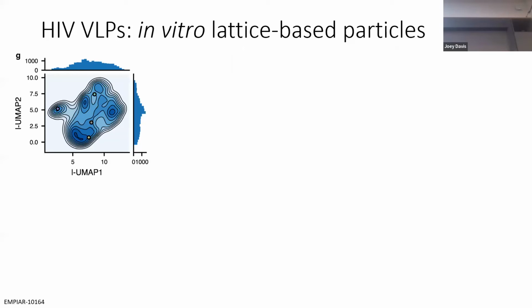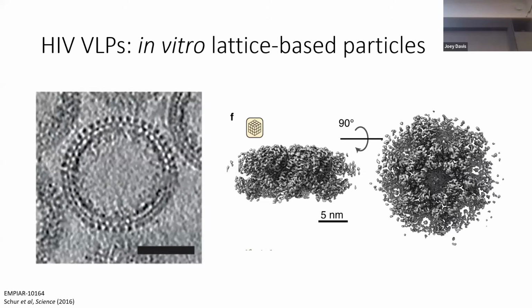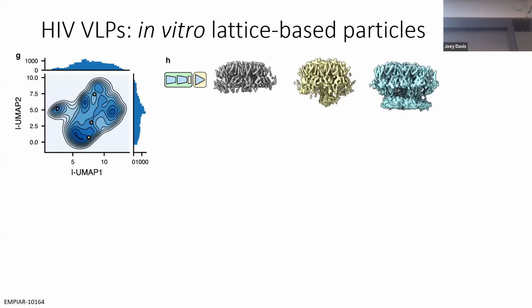I should say that this basically recapitulates the sort of structure that everyone determines when they look at this by tomography. But if you look more closely with TomoDRGN, you now actually start to see that there's heterogeneity. There's a whole other domain that's a little bit below the primary domain that everyone sees. That's encoded in the polypeptide. Everyone knew it was there, but everyone thought it was just too flexible to be able to see. And so I think this is back to your initial question. Flexible things we can see so long as you can align. And now we were able to start to see these.